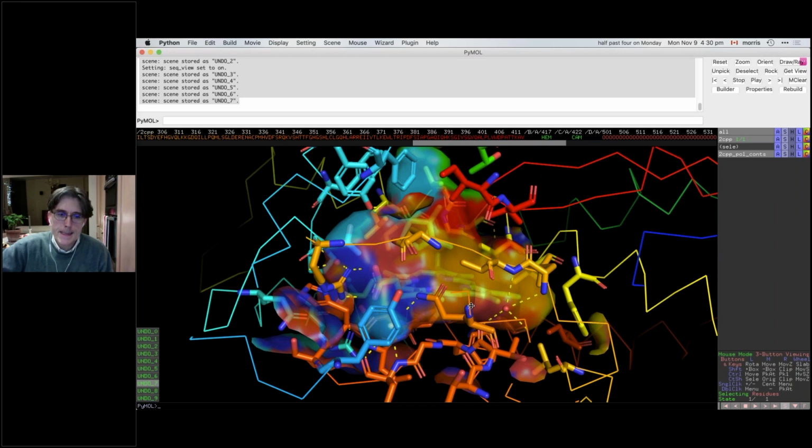Correct. One of the questions was, is the hydrogen addition in PyMOL reliable? I presume it means for potentially ionizable groups. Not quite sure what that means. Reliable? Based on the pKa, I presume. So it's quite a simplistic algorithm, and it does not do any titration on the protein.